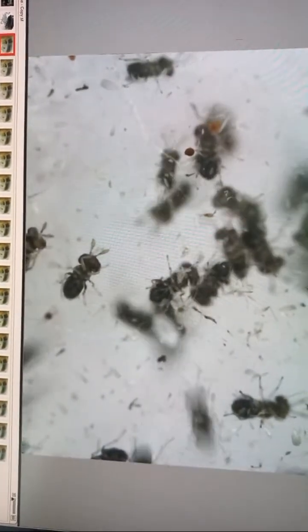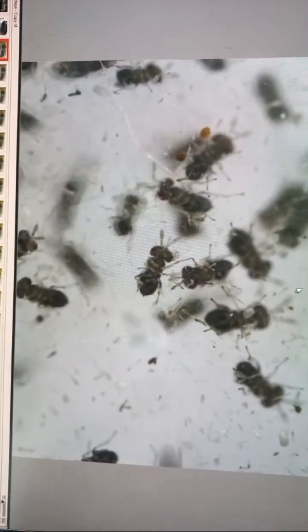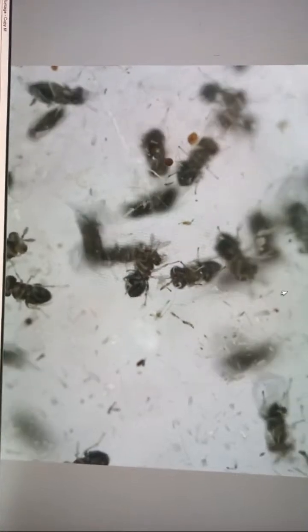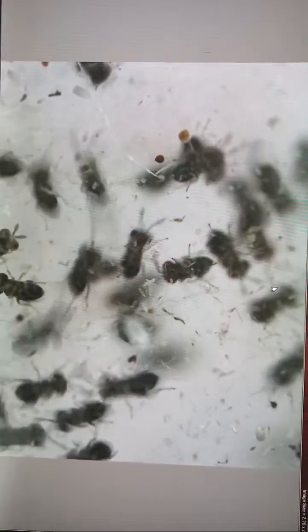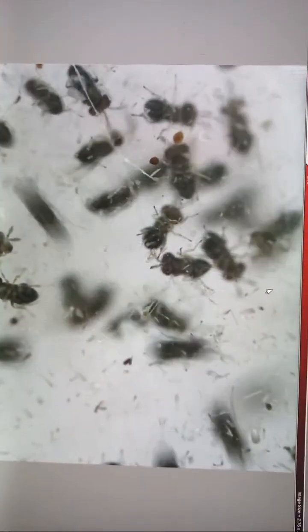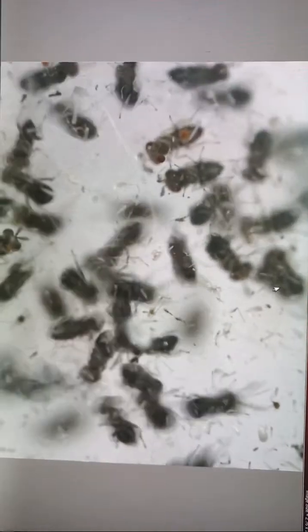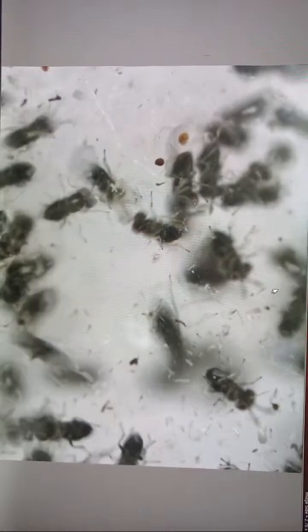Down where you can see small female with short antennae. In the center part also 2 females that do not move. And from time to time it's possible to recognize some mating individuals. Long antennae belonging to male and females. In males they are just attacking females, so they are mating. Sometimes they are crawling here together.